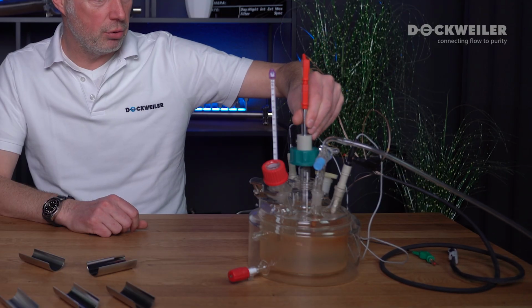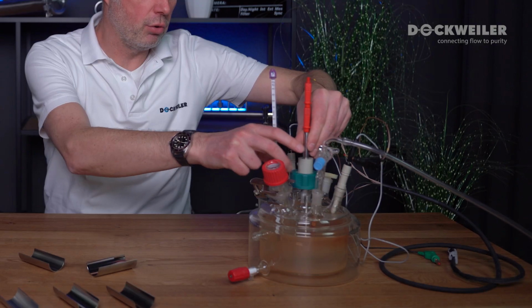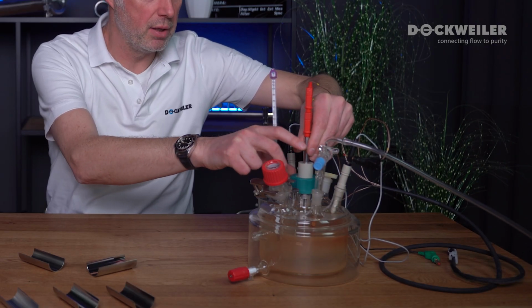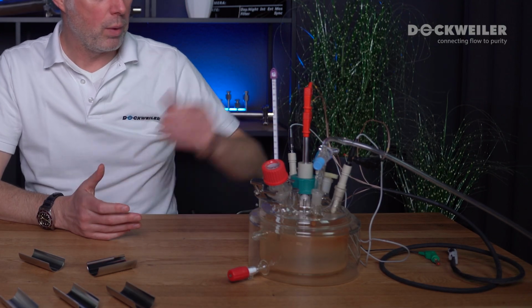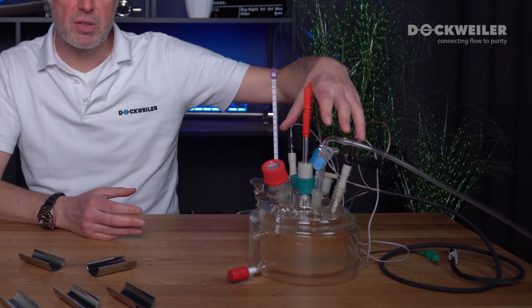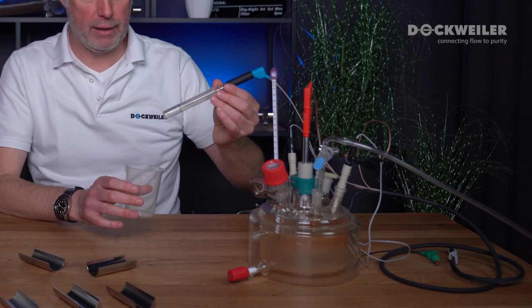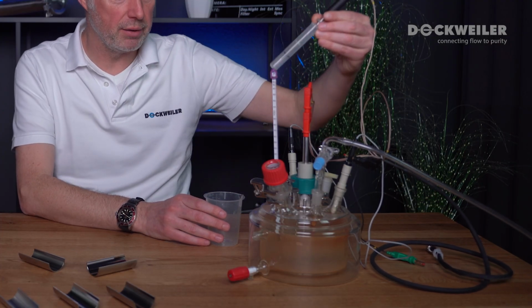So what we basically do in this setup is introduce the working electrode, which is our stainless steel surface that we prepared, into that unit. Furthermore, we have two counter electrodes in that setup and a reference electrode that we're going to introduce into that part here.